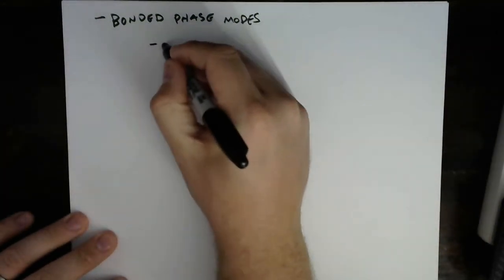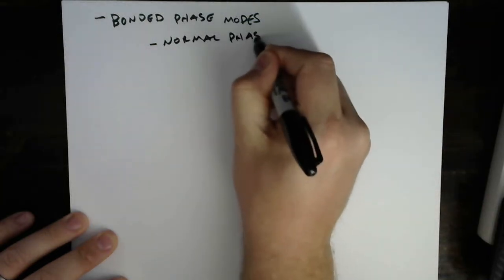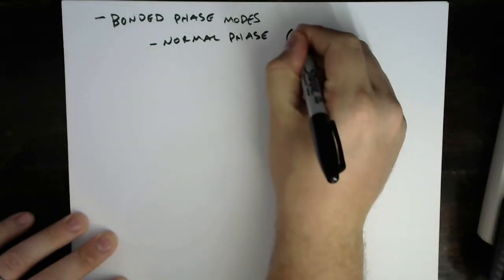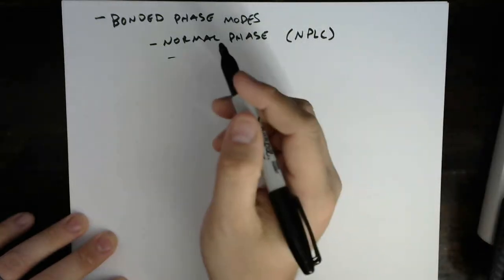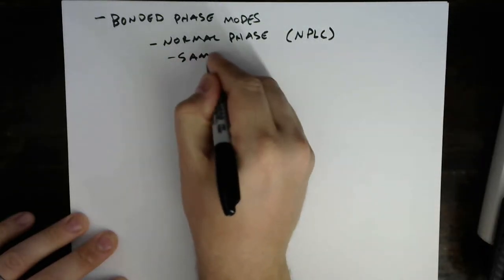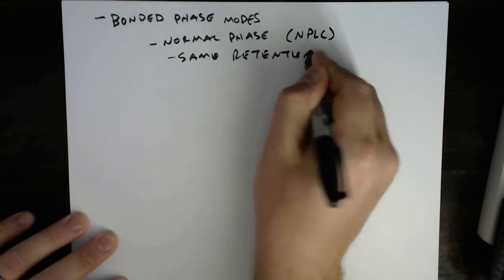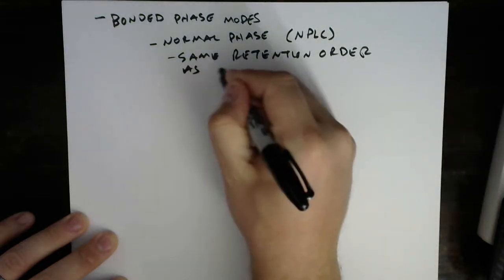The first, normal phase, or NPLC. So it just gives the same retention order as adsorption.